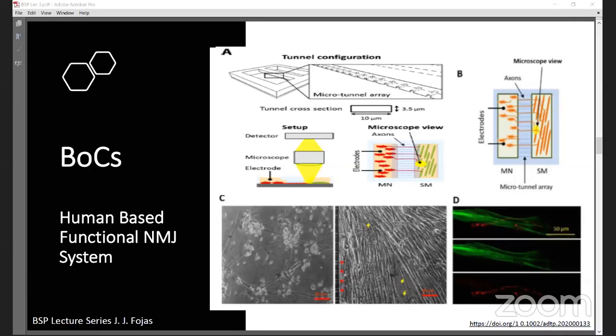You can see that your motor neurons were stimulated by field electrodes, and the induced myofiber contractions were also captured in this study by pixel differentials through a phase contrast microscope connected to a video camera. So I think I've stressed quite a lot about integrating your microfluidics with super resolution microscopes, or even just a confocal microscope. The advantage of microfluidic devices is that you can move them around, so you could couple them with different optical devices and even non-optical devices for measuring.